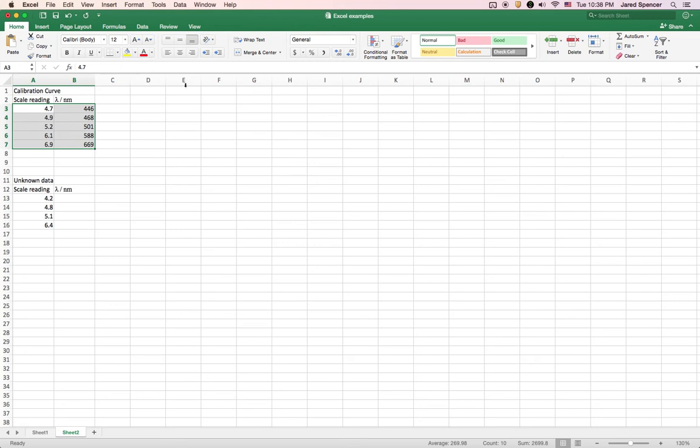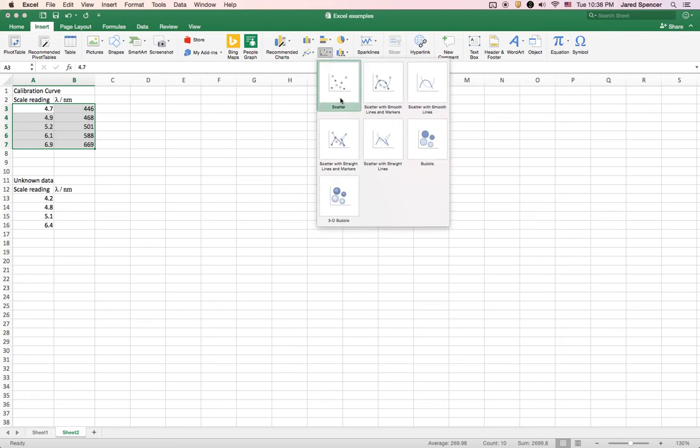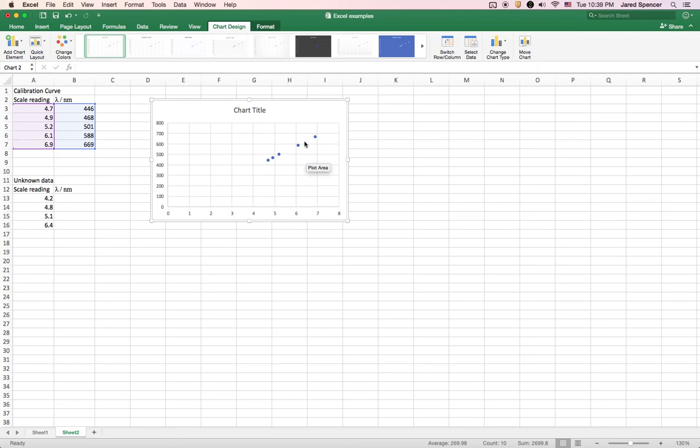Okay, so then I go to Insert, and there are lots of different kinds of charts that I can insert. But in the sciences, we generally almost always use what's called an XY scatter plot, or Excel just calls it scatter plot now, and it's just the dots of the data. I don't want any of these curves or circles or any of this kind of weird stuff. If that's something that I want on my graph, I want to generate it myself and not have Excel do it automatically for me. I just want Excel to put in the actual dots of data. So here they are, here are the dots of data. So our job is to turn this graph into something that actually looks nice. So that's what we're going to do.